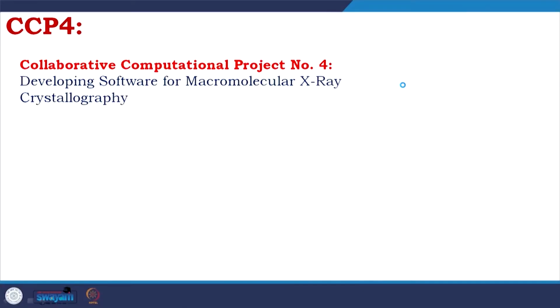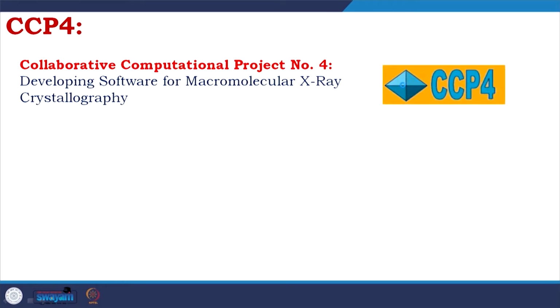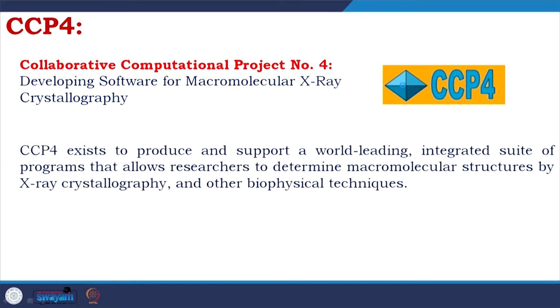And before going to the next step, I want to introduce CCP4. CCP4 is Collaborative Computational Project 4. It is developing software for macromolecular X-ray crystallography. This is the logo of CCP4. CCP4 exists to produce and support a world-leading integrated suite of programs that allows researchers to determine macromolecular structures by X-ray crystallography and other biophysical techniques.